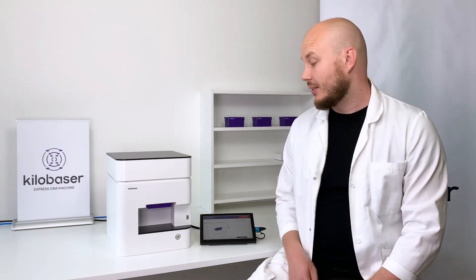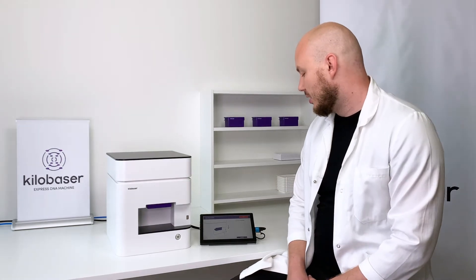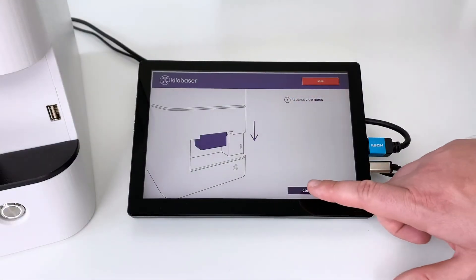Welcome to the Kilobaser Reagent Cartridge Change Tutorial. Whenever you need to change the Reagent Cartridge, the screen and the machine tells you to do so. It tells 'Release Cartridge.' Press Confirm.